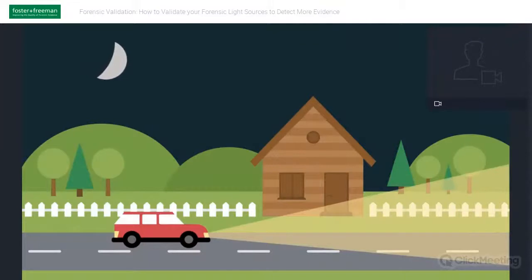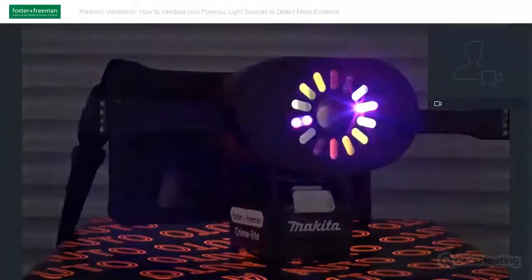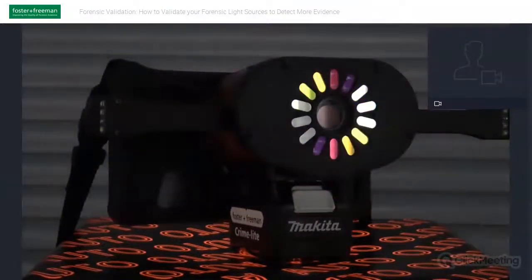Light sources can also be used for both contrast and oblique light examinations. For contrast imaging, we can use light sources of different colours to lighten or darken either the background or the evidence we are focused upon. Similar colours reflect, lightening colour, whilst opposing colours will absorb and therefore darken. This will create contrast between the evidence against its background and improves our visualisation of the evidence.